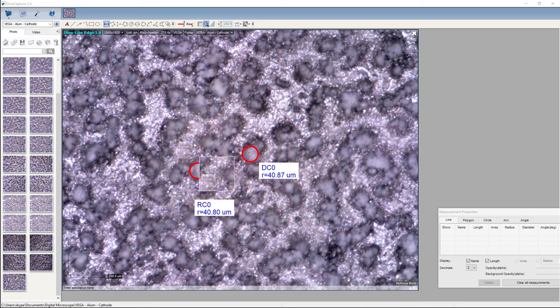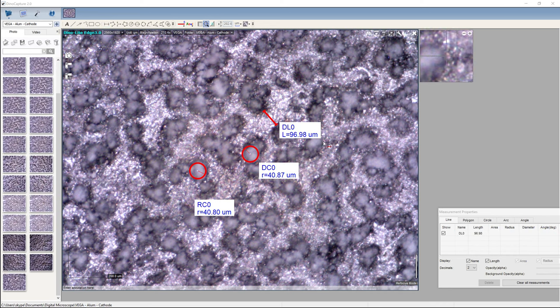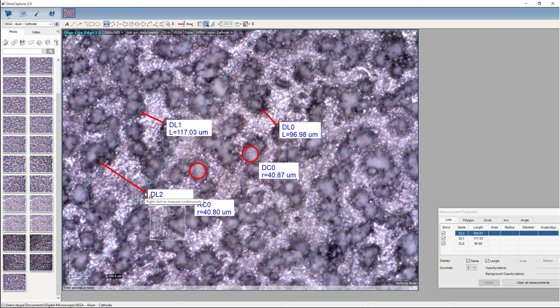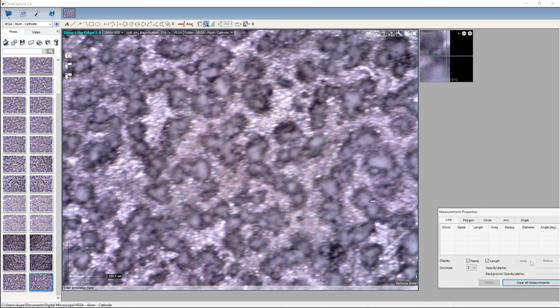Let's take a couple of measurements here. So the distance between those two, about 100 microns, 97, and between those two, 117. It's a big gap here, isn't it? Look at that. Gives you an idea anyway. Have a quick look around.